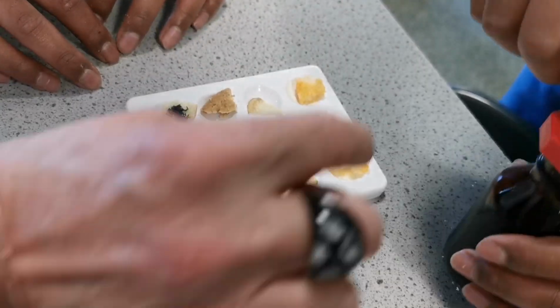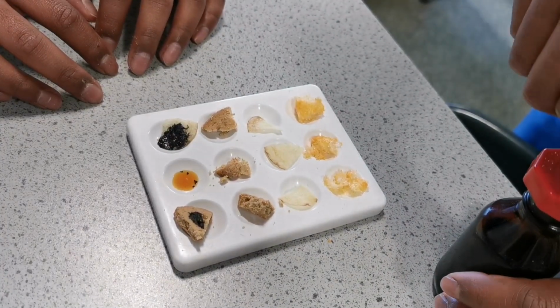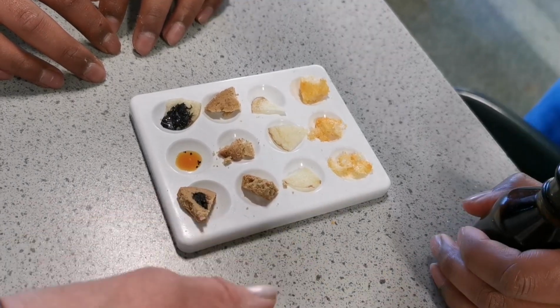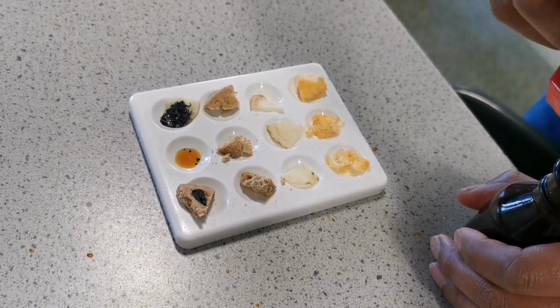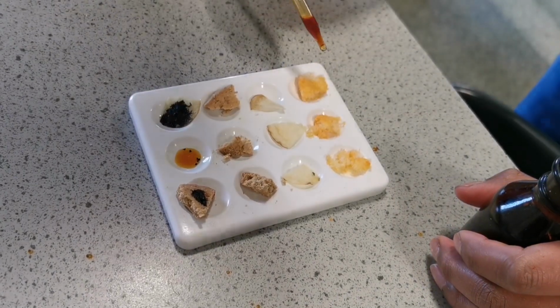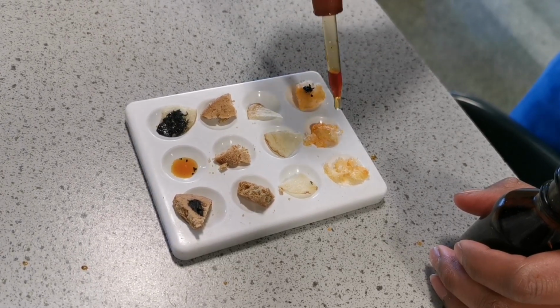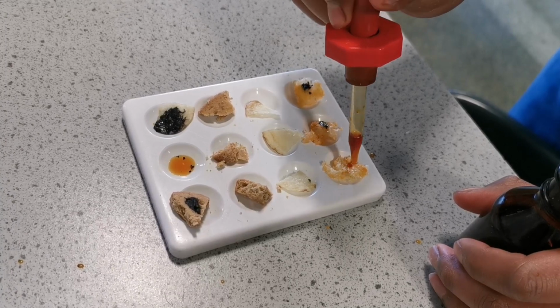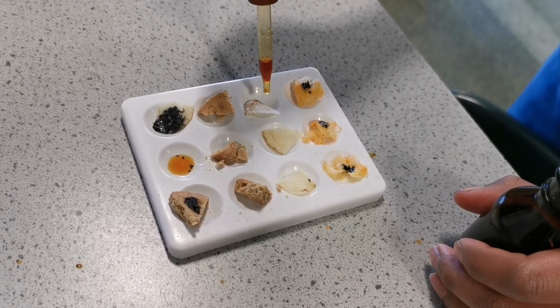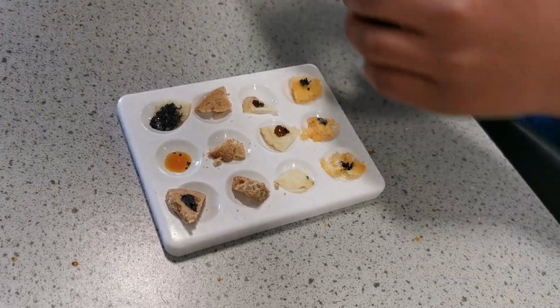Okay, so you can do maybe 5 and then you can do 4. We're going to do more than one here because obviously when we do a test, we like to test it more than once to give a valid result. Right, so we've got a positive there. That's it, keep going. So very clear that the Wotsits do contain starch.